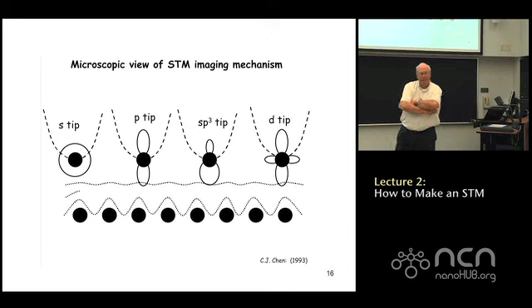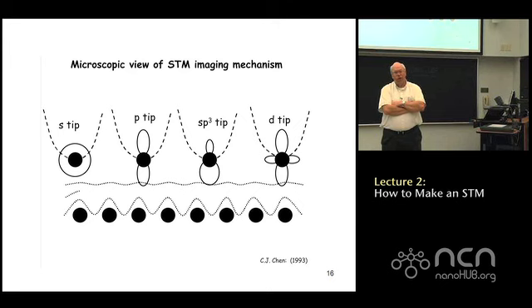So given that you can have all these orbitals present, the choice which one you choose is basically by the bias voltage, right? You can push up, or you can make sure the tunneling occurs from states that correspond to certain wave functions. Isn't that how you control it? Yeah, so there's two ways to adjust which state you tunnel through. One is by adjusting bias voltages, because you can then have a little bit of control over the states that tunnel. The other is by adjusting the symmetry of the atom on the tip, right?